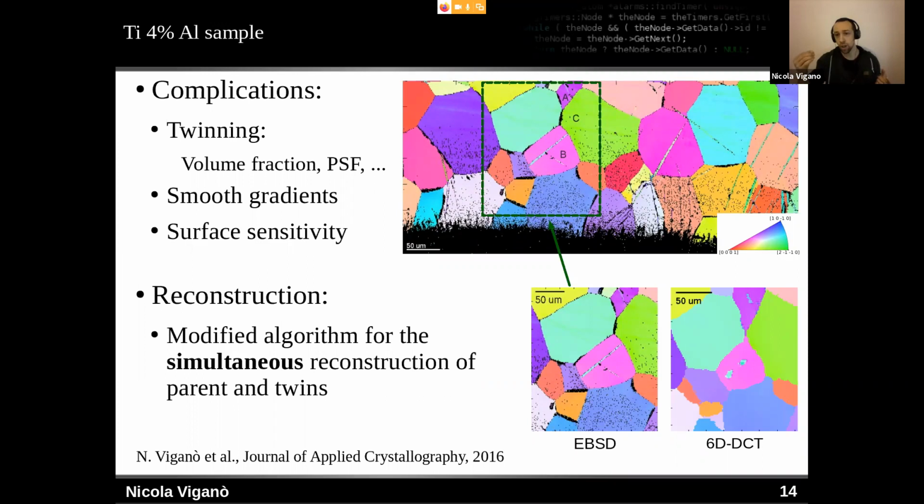But could our reconstruction actually reconstruct them? So we modified the algorithm to take into account multiple bounding boxes in orientation space, which was basically reconstructing on a disjoint 6-dimensional space, non-connected, so to say. And it could work, but we see, unfortunately, that the resolution wasn't the best. So we could see these grains, but it was not ideal.